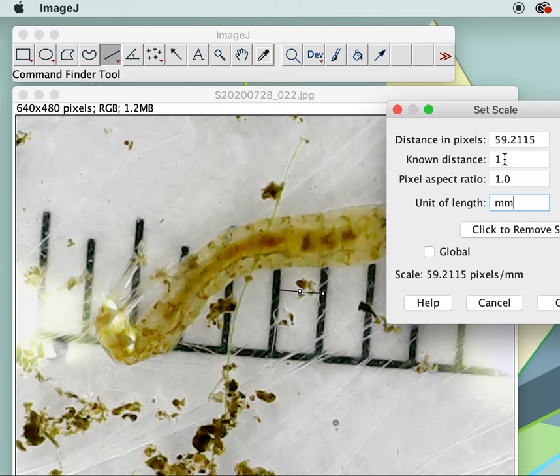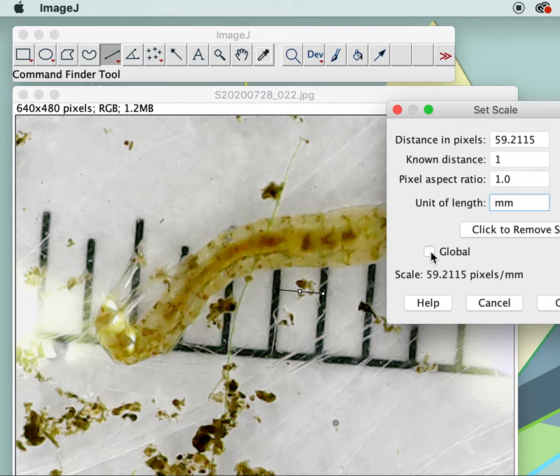You can click Global if you're going to use the same scale for each picture — if you took all the pictures with your microscope at the same distance from your organism. I took a bunch at that very same distance so I'm going to click Global and OK.